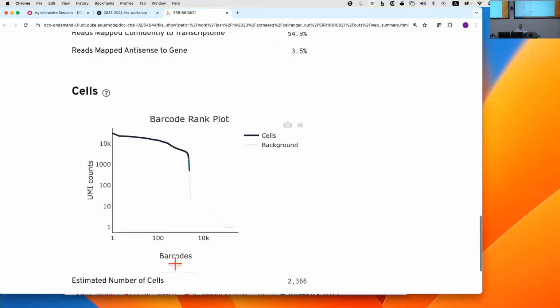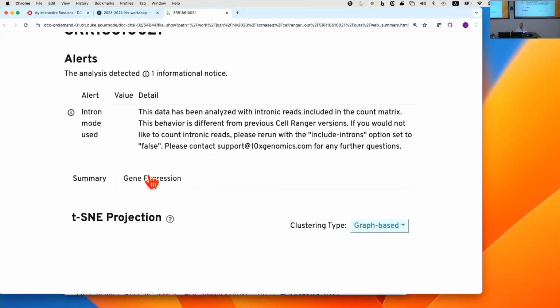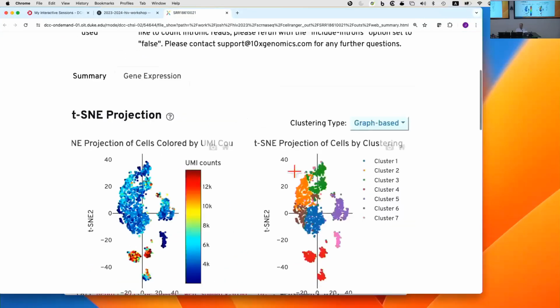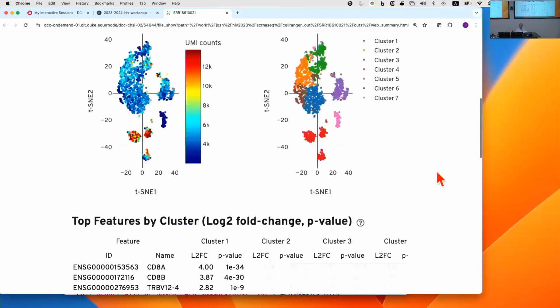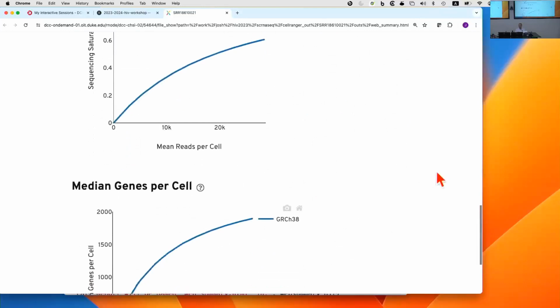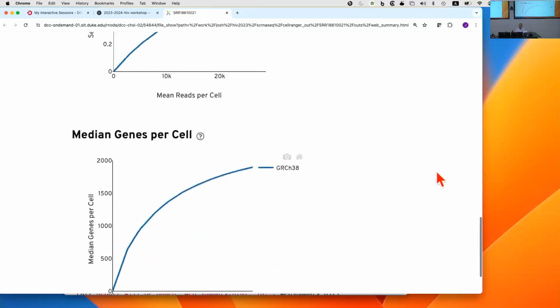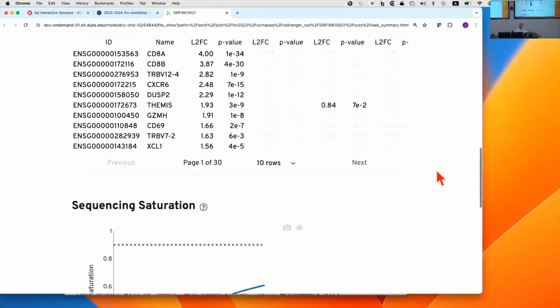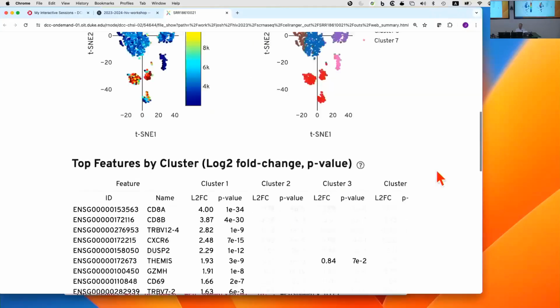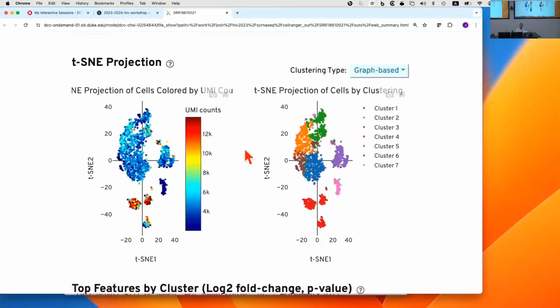Yeah, I think that's all the interesting stuff in here. And the other tabs are, for the most part, not super interesting. It does a little bit of analysis that you're going to ultimately want to do downstream, but it just does this sort of default thing. So it doesn't know anything about what the data is. It's kind of clustering cells, like here you've got 7 different clusters.